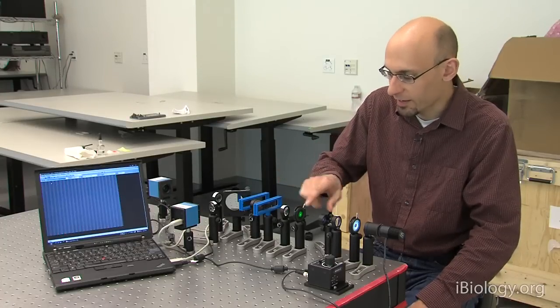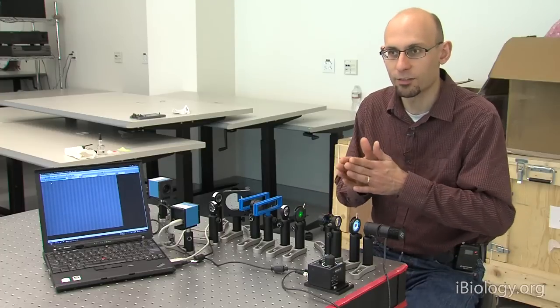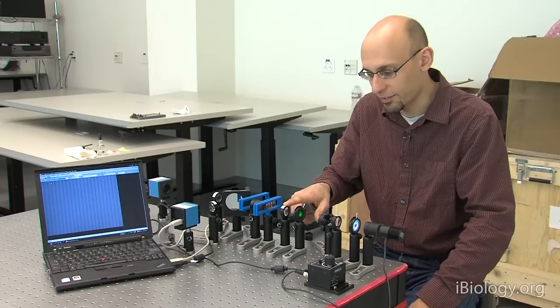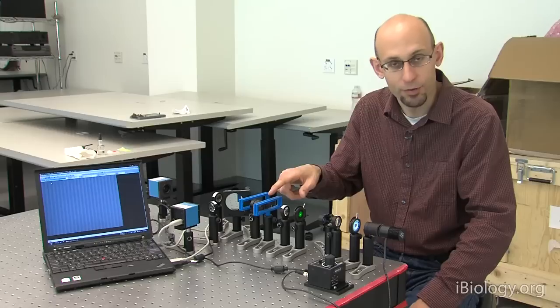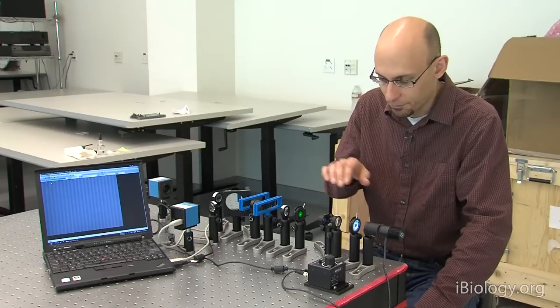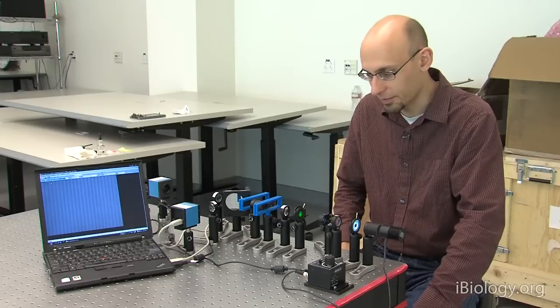So opening and closing this iris controls the range of angles that illuminate my sample, and we'll mostly be leaving this closed so that we're illuminating with just a pencil of light going right down the center of our sample here with parallel beams of light. And this then is our condenser lens, and so this lens is then focusing the light onto the sample. And this whole system is set up for Köhler illumination so that the LED here is in the back focal plane of the condenser, and then this field diaphragm is conjugate to the sample plane.